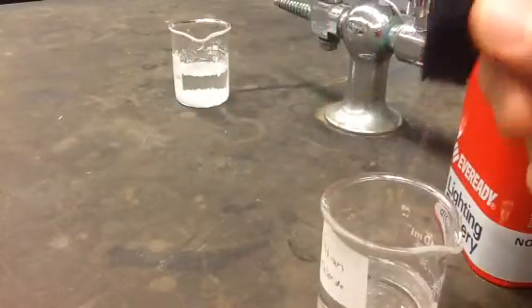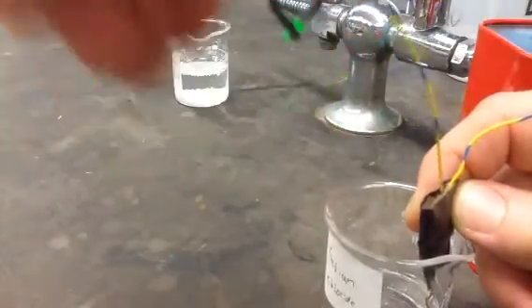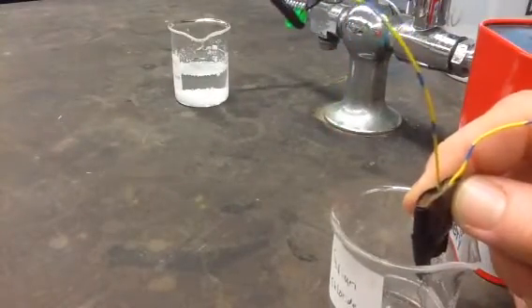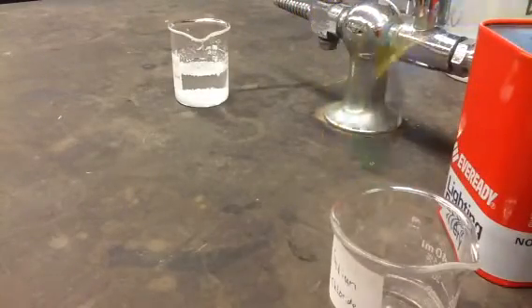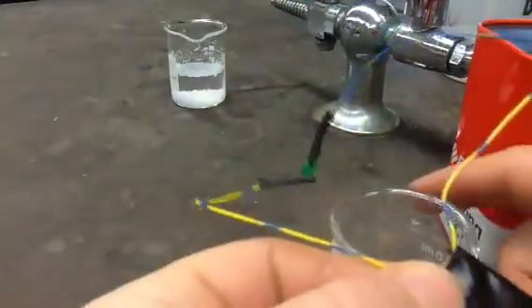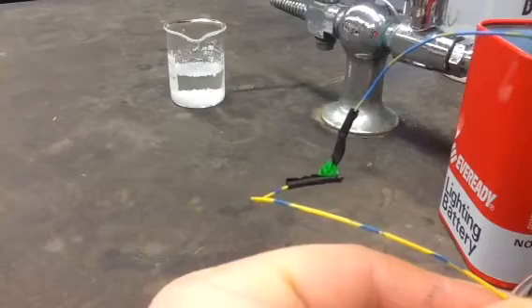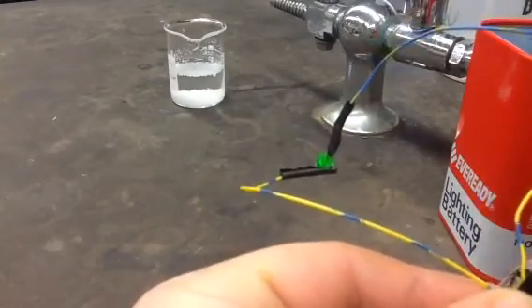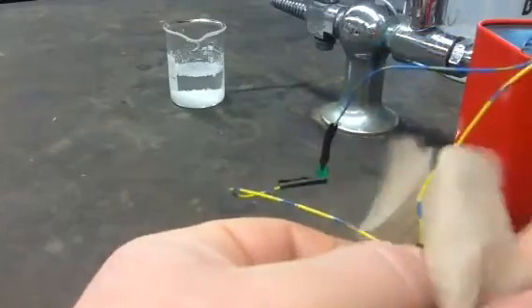Here's our sodium chloride solution. This is a good old table salt solution. And this one should light up like a Christmas tree. Oh yes. Very nice and bright. So I can get a better perspective on the bulb. Yeah. Very bright. Okay. And then our final solution is the phenyl salicylate.